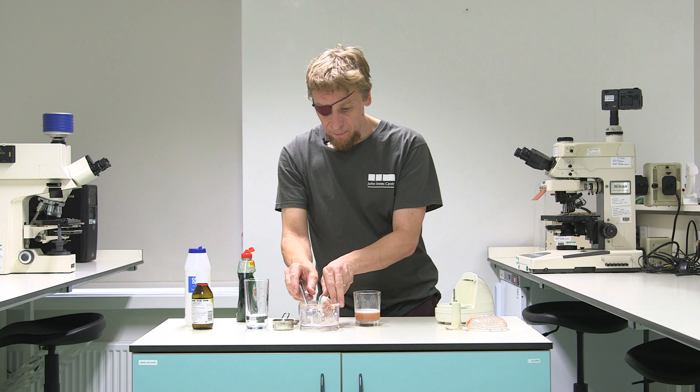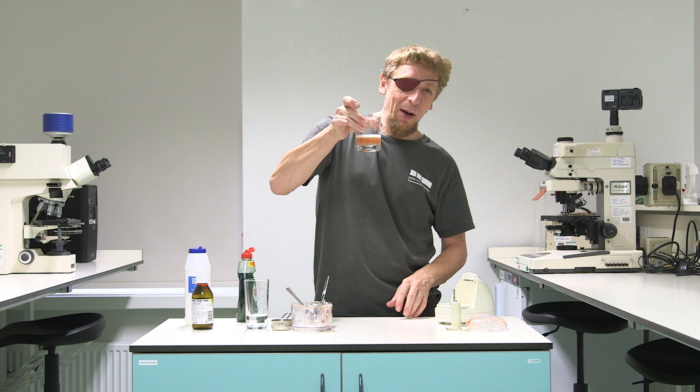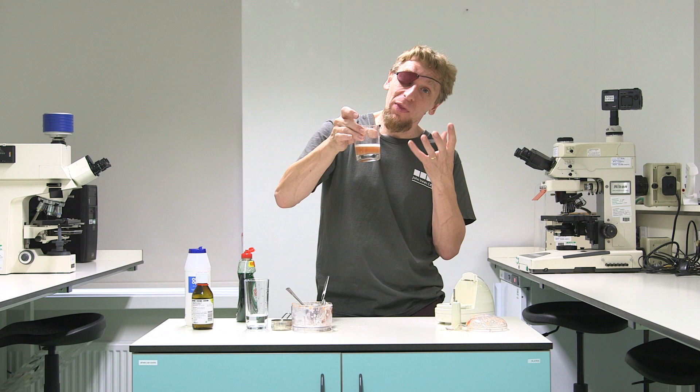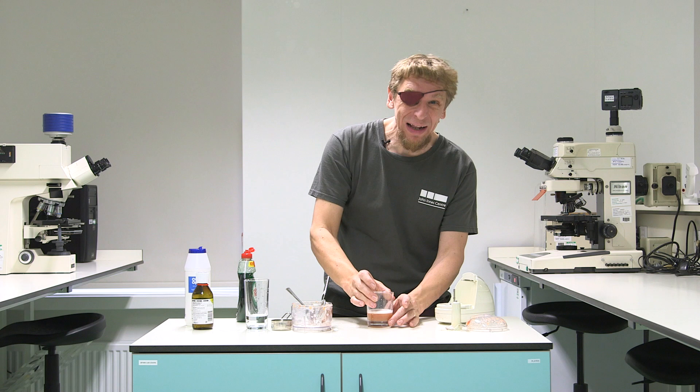Okay, so in the glass then, we've got the juice out of that tomato and we know that contains the DNA, and we hope we've broken open those cells so the DNA can escape. But there's still some quite large things in there - some bits of broken cells - and we want those to settle out of the way to make it easier to see the DNA. So we're just going to leave it for about 10 minutes for that settling to happen.